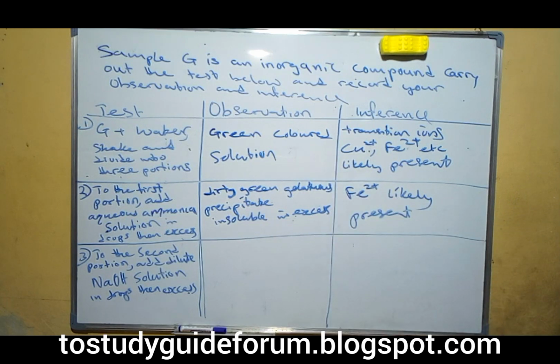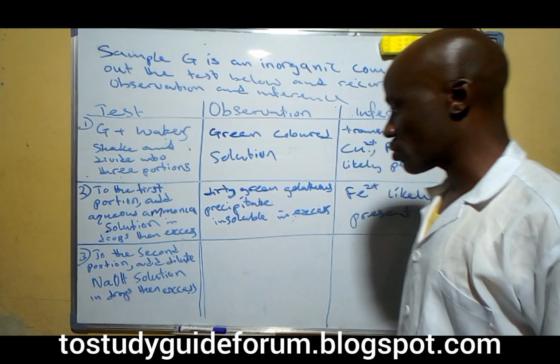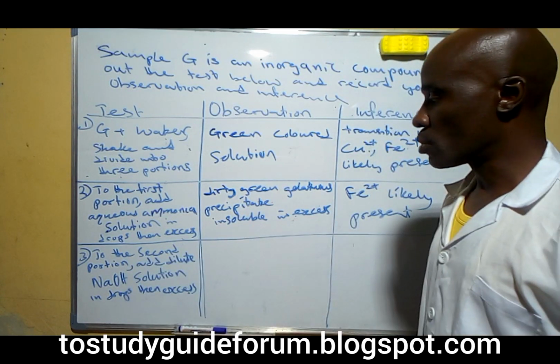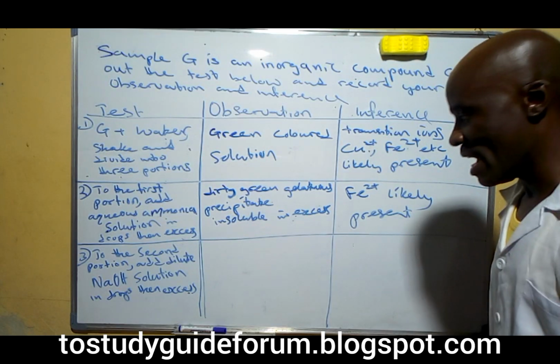The next thing we do, the second portion, is add dilute sodium hydroxide solution in drops and in excess.